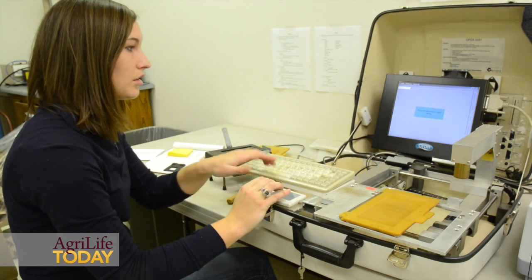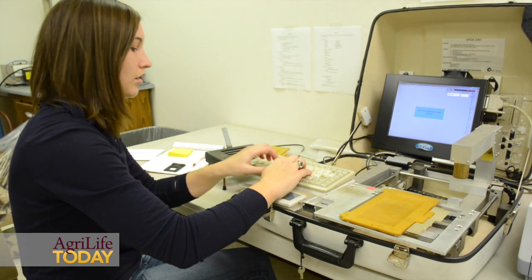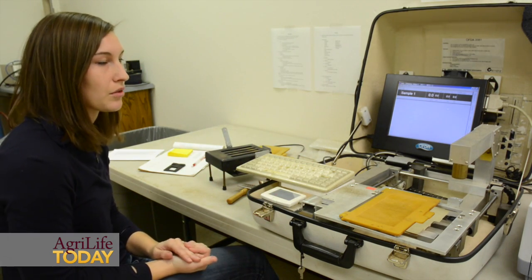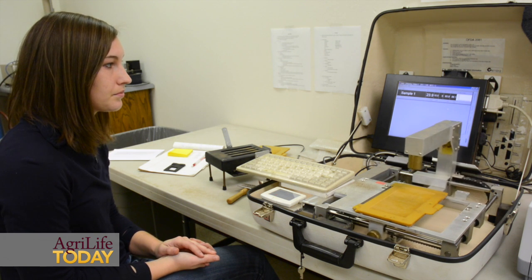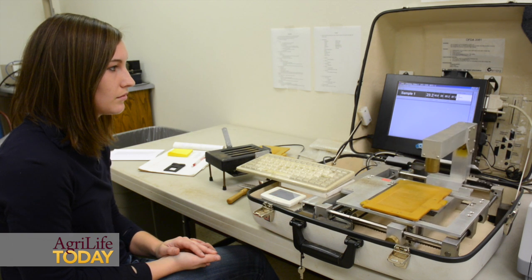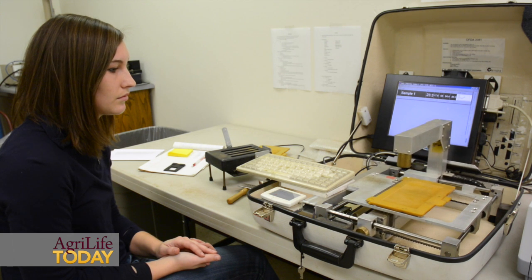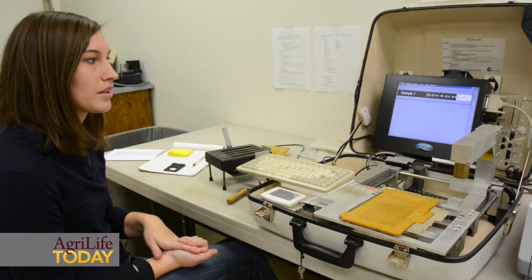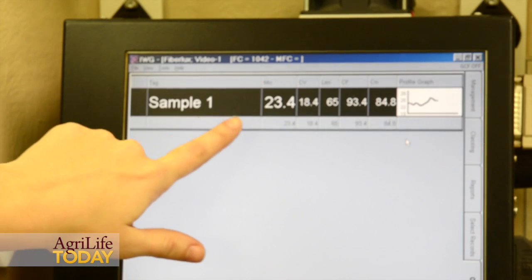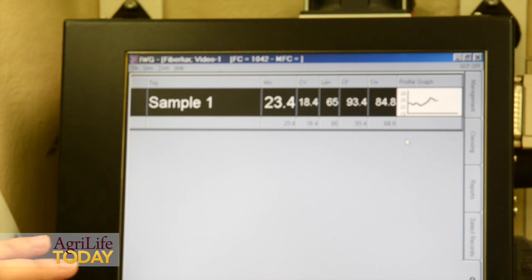You'll hit the space bar for it to start testing, then enter a sample number — typically an ear tag number or some identification for the particular sheep. Now it's reading the sample. This machine also gives you a little bit more information than the FiberLux. Here you'll have the micron diameter, which is the main measurement we're looking for from this device.